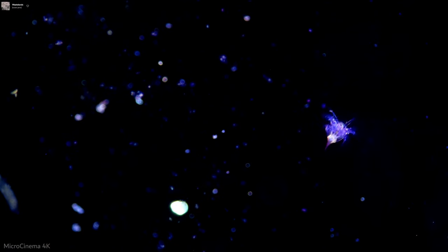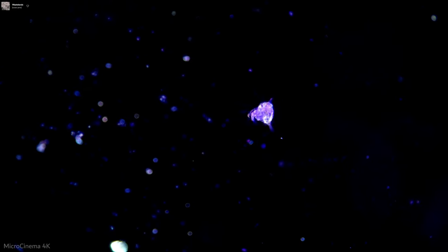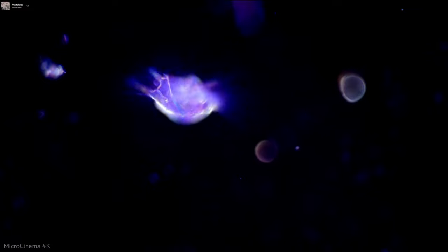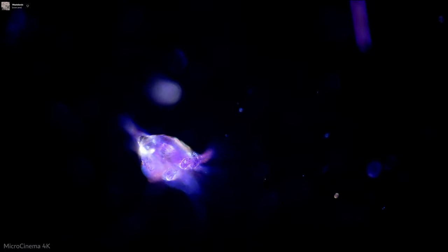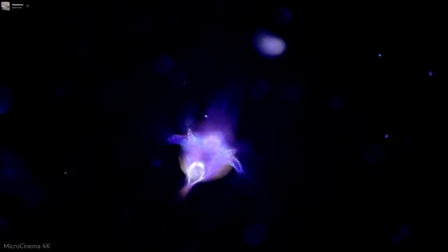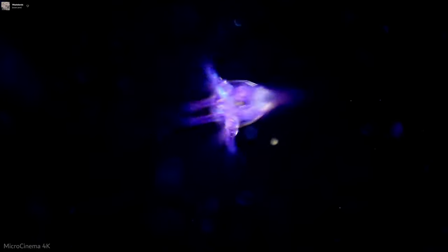But now, I'm gonna crank our ISO way up. Dark field, polarized light. Mm-hmm. Now, if you guys try out dark field polarized, you might find that you can probably see it, no problem. Your eyes are extremely sensitive light-sensitive devices.